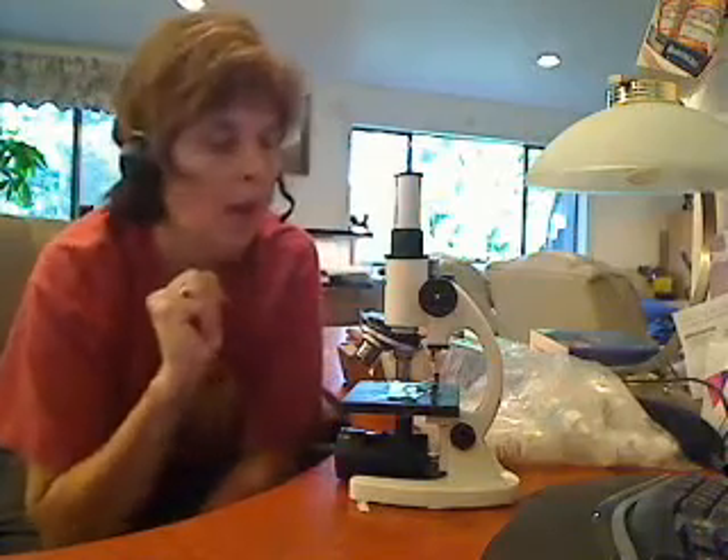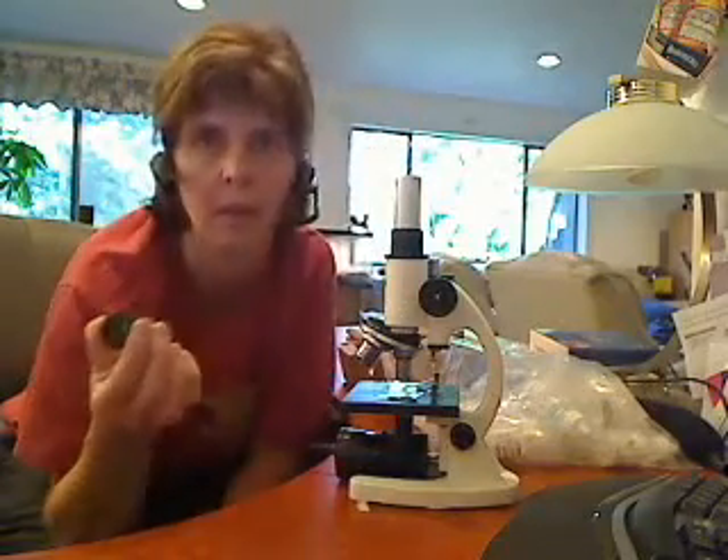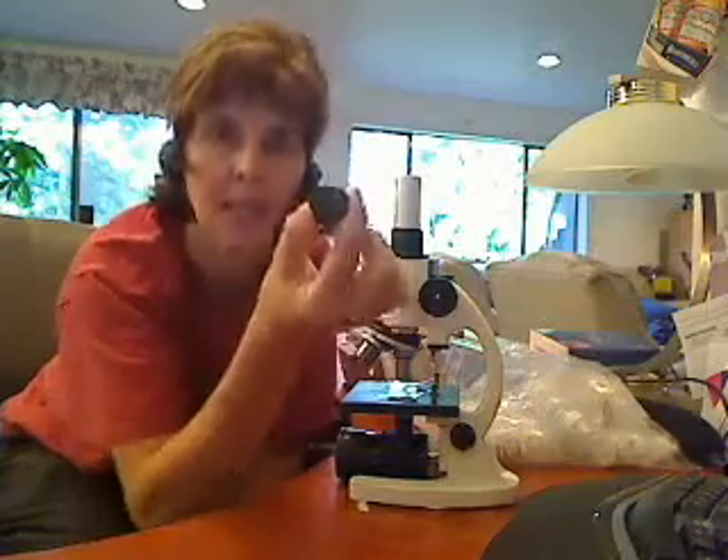So here's our microscope. This is the ocular lens. How much is it magnifying by? You want to take a look at the top — you probably wouldn't normally want to do this — but it says 10, so it's magnifying by 10.